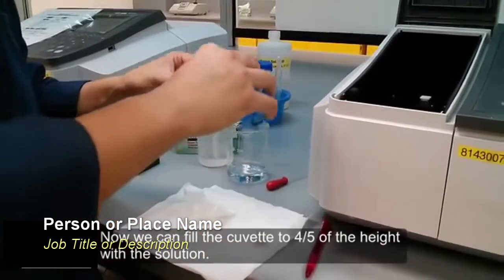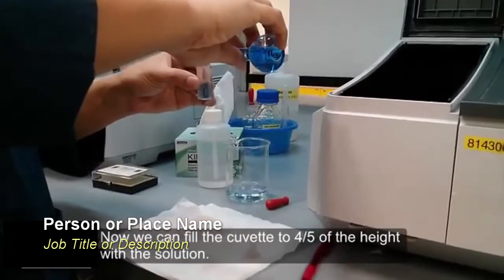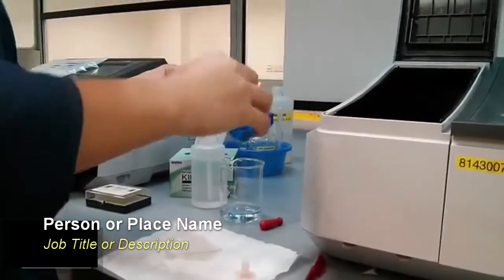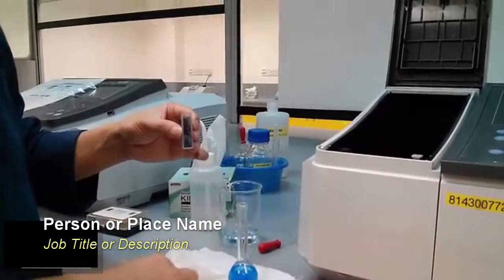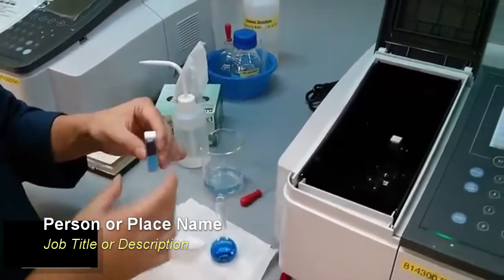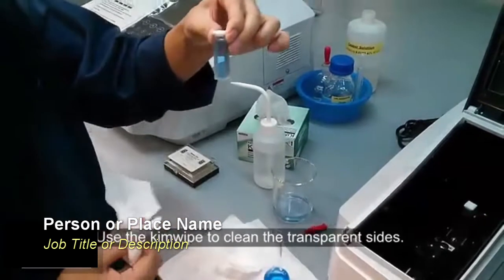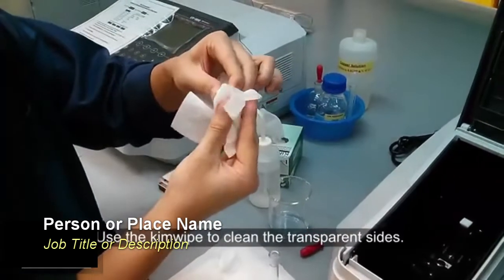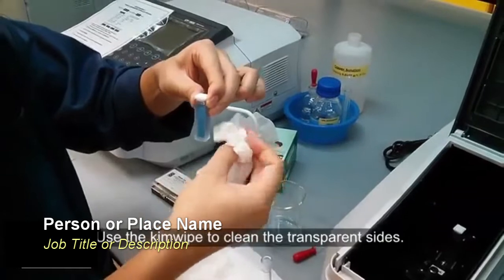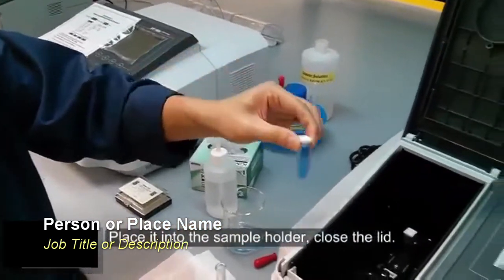Now we can fill the cuvette to 4/5 of the height with the solution. Use the Kim wipe to clean the transparent sides and place it into the sample holder.